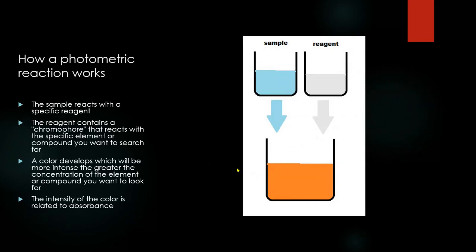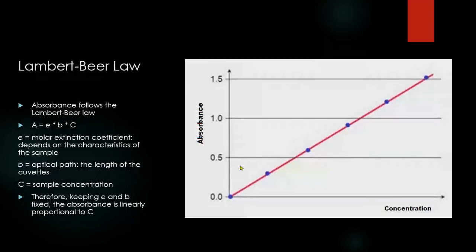Depending on the reagent we use, there is a different color development, and so a different relationship between absorbance and concentration. The relationship between absorbance and concentration is inside the memory in the program of the instrument. So the instrument will measure the absorbance, and by the data inside the instrument, it calculates the concentration of nitrate, ammonia, or iron, and so on.